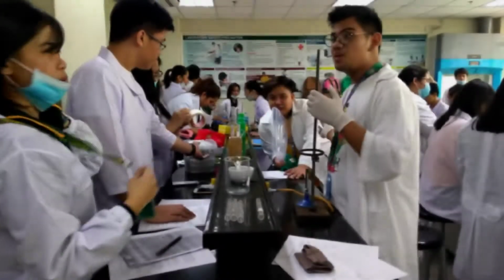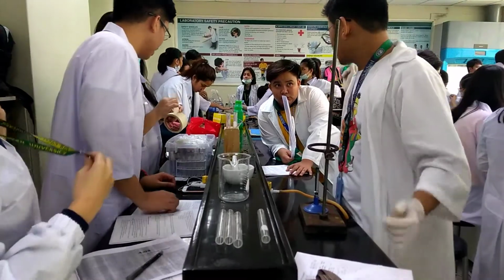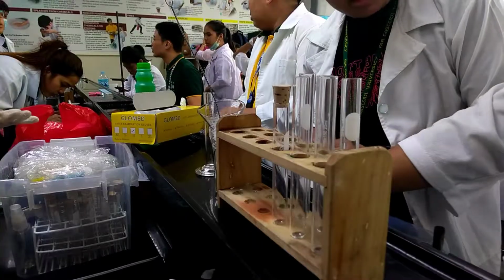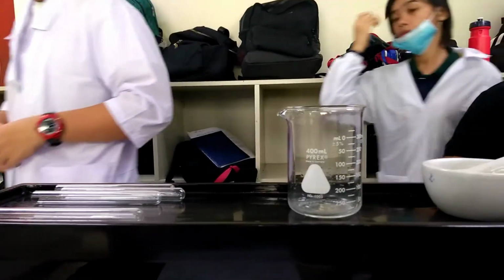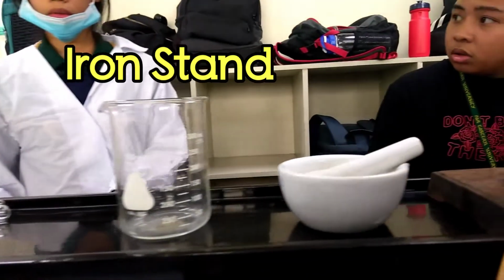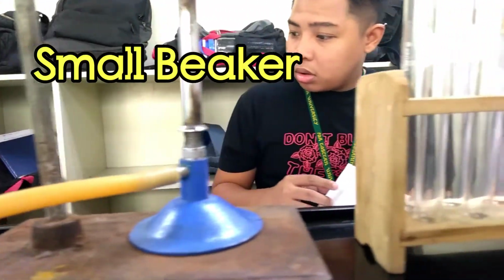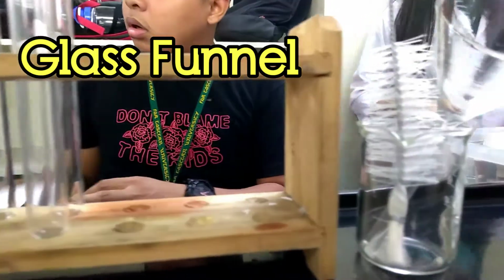Separation and purification of organic compounds are skills that every person from STEM must master. It is a lab procedure that can be used in biology, chemistry, and in medicine. The materials you'll need are the Bunsen burner, iron stand, iron ring, iron clamp, mortar and pestle, small beaker, large beaker, test tubes in a rack, evaporating dish, glass funnel, Whatman paper number 1, and leaves.